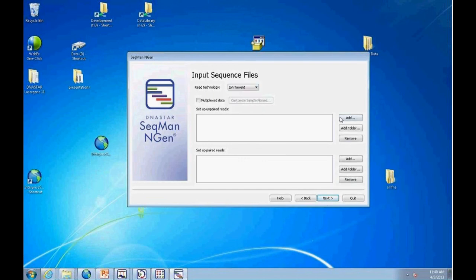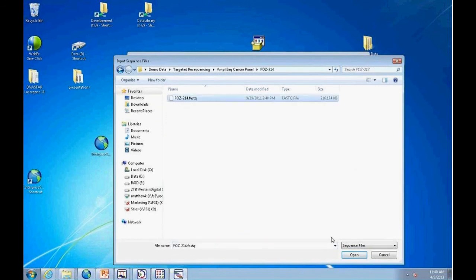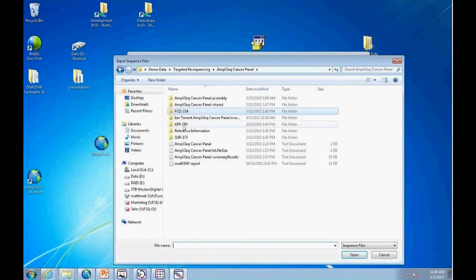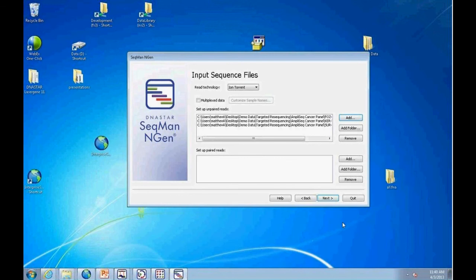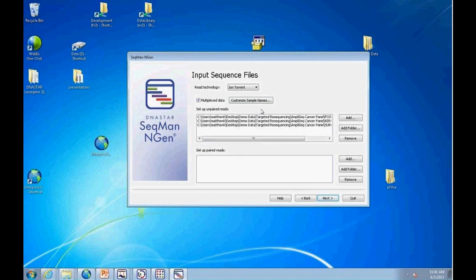After picking the platform and loading FASTQ files, three different samples are loaded. SeekMan Engine supports aligning multiple samples at one time — select 'multiplex data.' Ion Torrent data will be demultiplexed, so ensure whoever runs the instrument checks the demultiplex option before sending data. Always demultiplex at the sequencing machine, since it knows exactly what the barcodes and samples are. Doing it downstream can introduce errors. In the software, you then define sample names manually, though automation for this is coming in a future update.